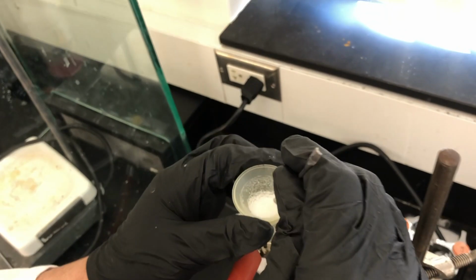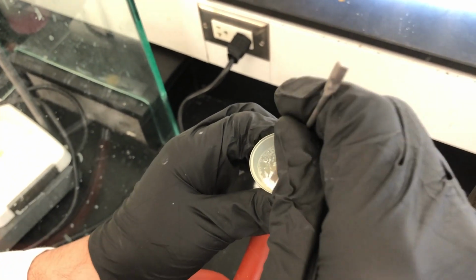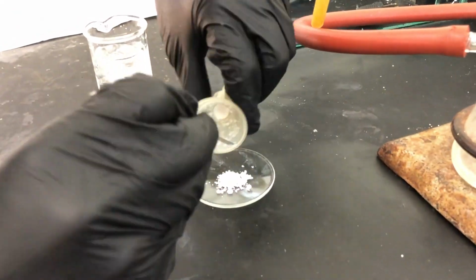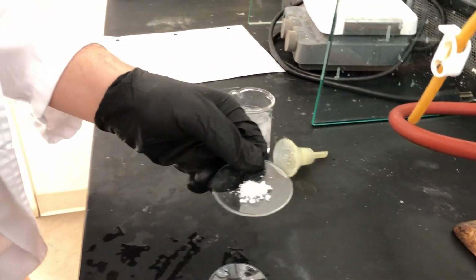Okay, so this is our pure product. Let me dry it up as much as possible. It looks really nice. Now let's put it in the oven for a few minutes to let it dry.